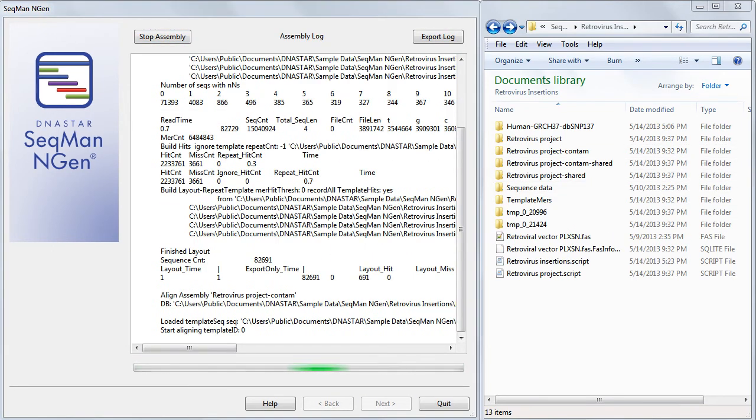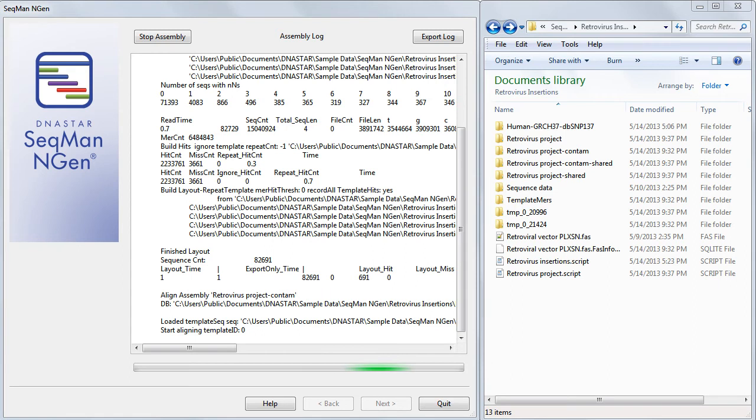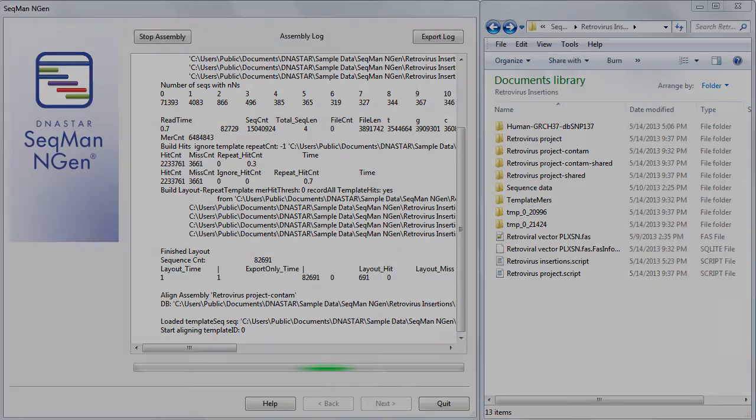During assembly, SeqMan NGen will first align the sequence reads to the retrovirus sequence, then collect the aligned reads, and then align them to the human genome reference. The reads of interest are chimeric reads that contain portions of both human and retroviral genomes, and align to the integration sites in the human genome.